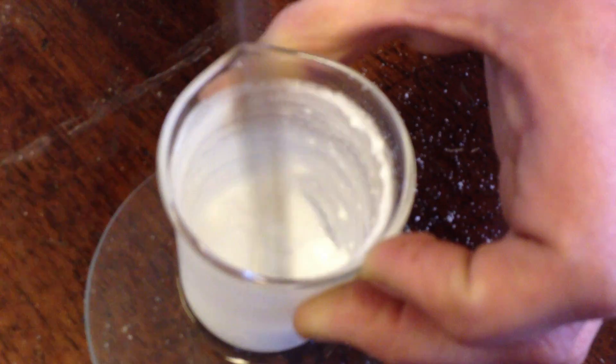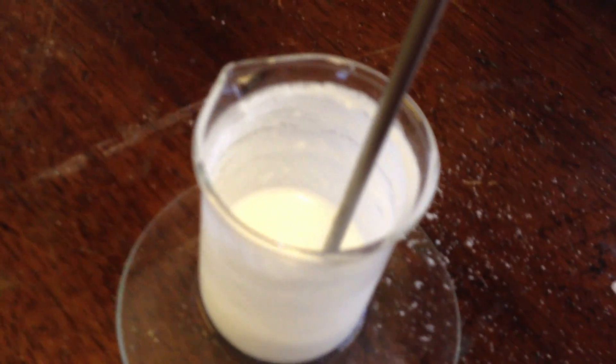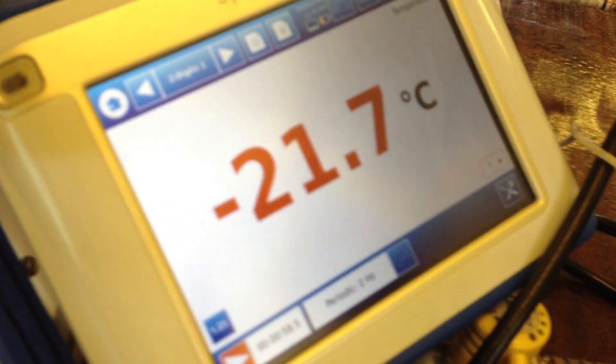You can see now we've actually got quite a pasty liquid and we've also got quite a big smell going on. That's because we have made ammonia, which we test for with litmus paper.